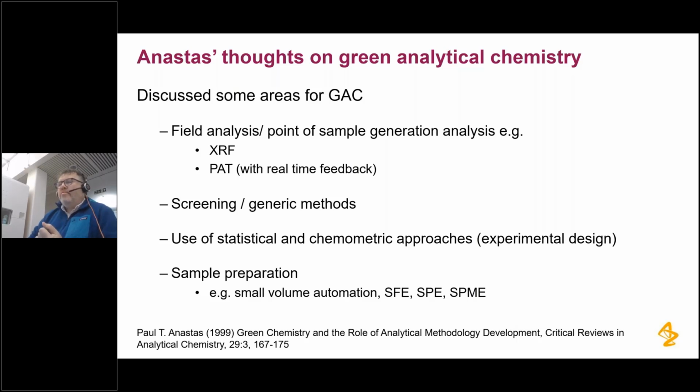Other areas where green analytical chemistry can be really important is taking your analysis to the point of source. So field analysis in the field, so to speak, where the sample is being generated, whether that's at the plant where the sample is being produced, or literally in the field when it comes to environmental samples. Can you take your instrument to that point and do your analysis there?